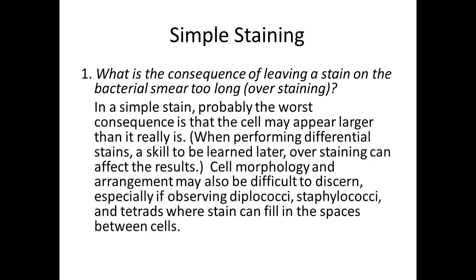So my golden rule in microbiology is 1 minute. If you're not sure, do it for a minute. Same thing for gram staining, right? Some procedures out there will have a bunch of different times and seconds. Just do everything for a minute. It's long enough, but not too long. And it's easy to keep track of on our clock. Just watch the second hand go around one time. So that's what we will do today, 1 minute.